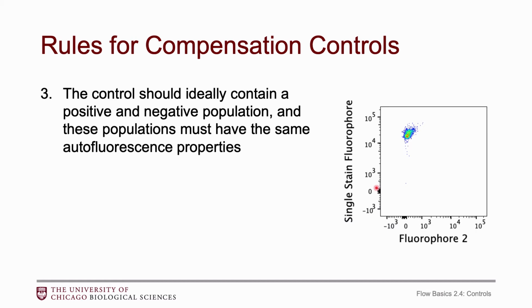You therefore need your FITC negative population to be on cells. So within fluorophore, they need to match, but within an experiment, you can mix and match. Half your controls can be on compensation beads and half of them can be on cells. That's fine.